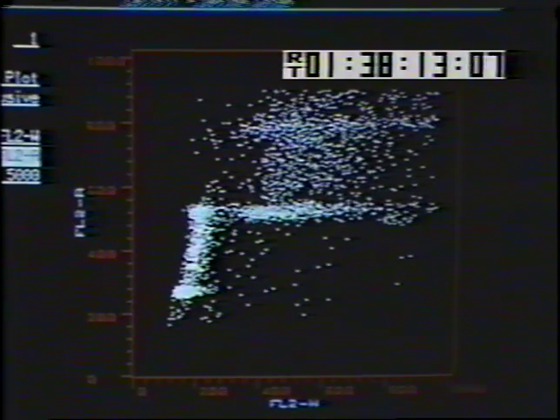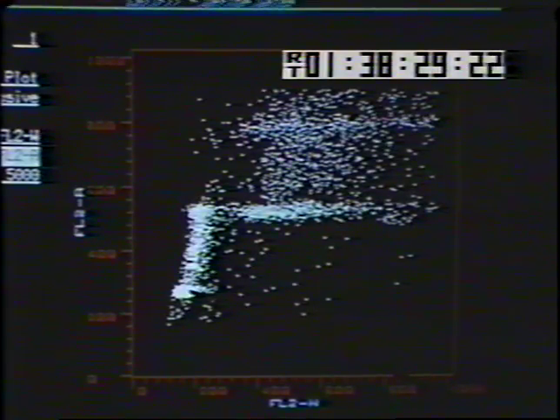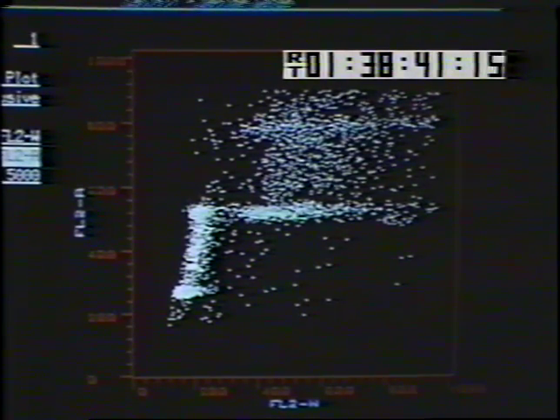This image represents an actual measurement of DNA content in a cell which is rapidly dividing. By the position, we are able to establish each of the compartments or activities of the cell. This group represents cells which are not dividing and are quiescent. This group represents cells which are increasing their DNA. And this group represents cells which are about ready to divide into two daughter cells. This is an example of what one would see if one was doing DNA analysis sitting at the flow cytometer.